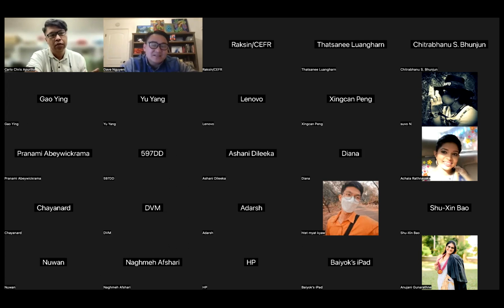But the second way, which is more effective, is just thresholding, through color or intensity. You filter for the brightest pixels of certain color channels, and therefore you can create a mask of every particle at once in your image. Right now we do that through Fiji or ImageJ, which is open source software, so it's free. But in the future, we'll build that into our own Shape Genie. For now, in the beta version, we don't have that yet. So we recommend using something like ImageJ or Fiji.